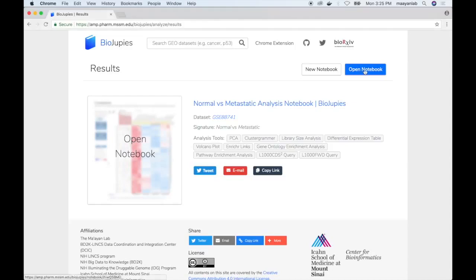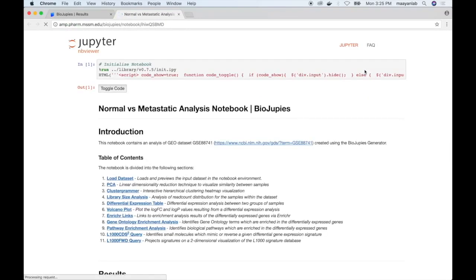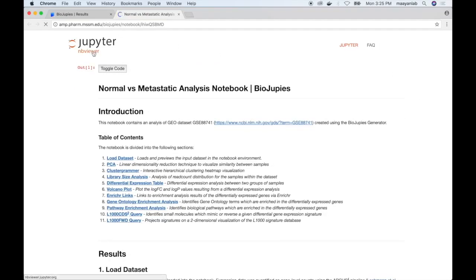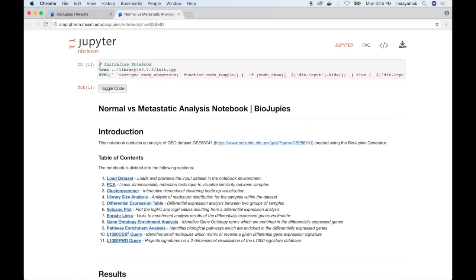We can click on Open Notebook to visualize the results of the analysis itself. The Jupyter Notebook is displayed statically using the Jupyter nbViewer service, and we also provide an option to toggle the code, which will then display the source code in Python and R used to generate the notebook.